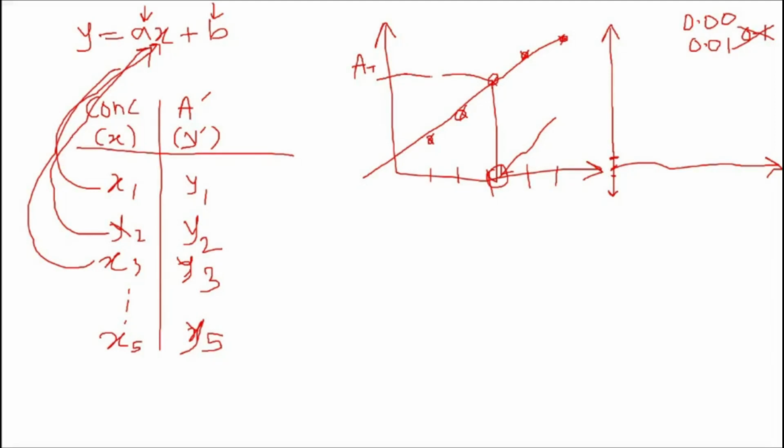Okay, Shanuri wants me to repeat it. See, Shanuri, you know what is B. B is your y-intercept. Okay, so you plot that y-intercept on y-axis. This is your y-axis. There is absorbance on your y-axis, and I should say corrected absorbance on y-axis and concentration on x-axis. They have different concentrations.